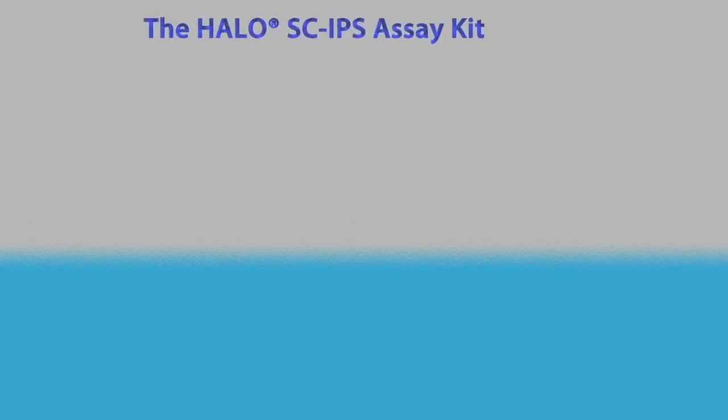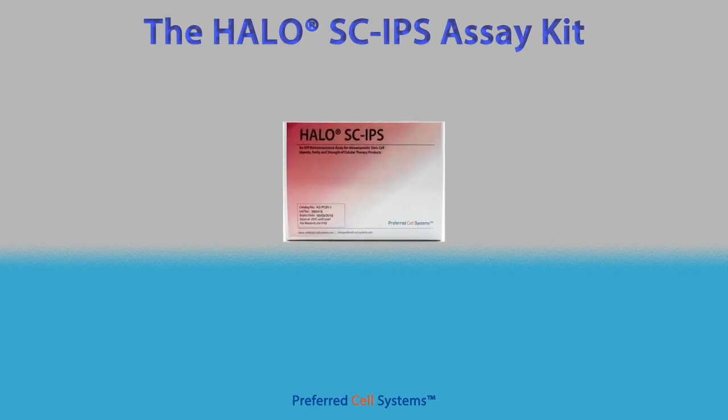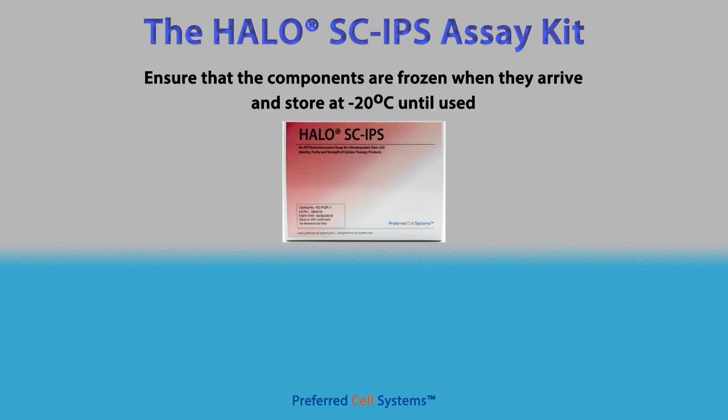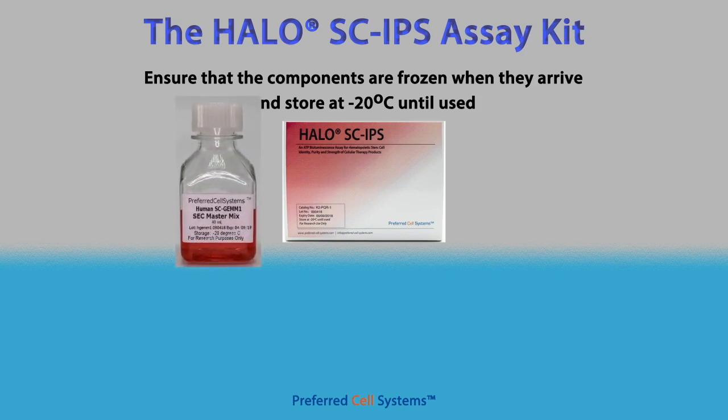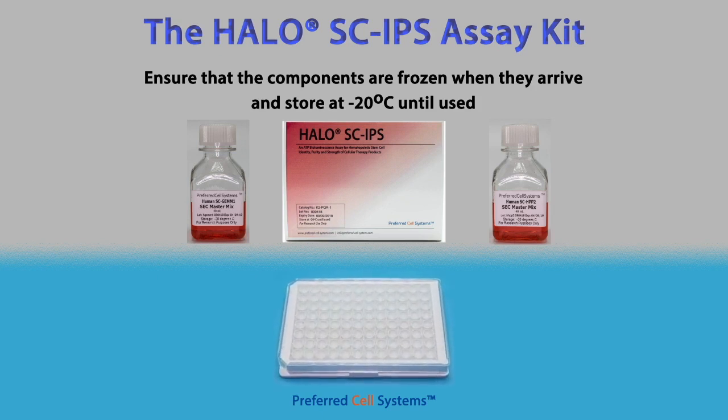Let's begin the second part of this tutorial by taking out the components we need from the Halo SC-IPS assay kit box. Everything you need to culture the two stem cell populations, calibrate and standardize the assay, and measure your samples are in the assay kit box. The assay kit should have arrived frozen, and the box should have been placed in a freezer at -20 degrees Celsius. At this time, you will need to remove the bottle of SC-GEMM Master Mix and the bottle of SC-HPP Master Mix. Also remove the individually wrapped sterile 96 well plate. Everything else can remain in the box at -20 degrees Celsius.